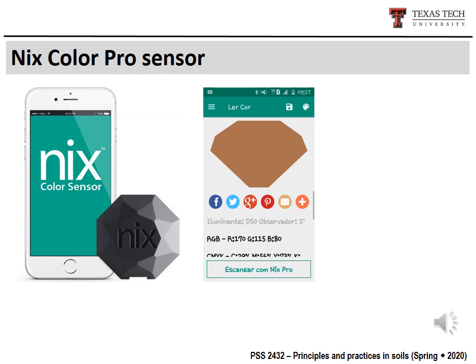And it costs around $300, and it has been very useful in soil science. But unfortunately, it can't measure the soil color in the Munsell system. And in soil science, traditionally, the soil color is measured based on the Munsell color system.